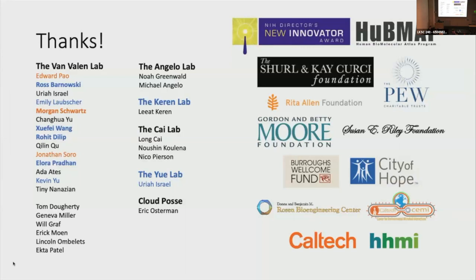And I think for a lot of folks, things like Mesmer can reach good enough. And then one question here on the Segment Anything stuff you showed. Did getting SAM to match the performance of Mesmer involve fine-tuning, prompt engineering, or both? Both.